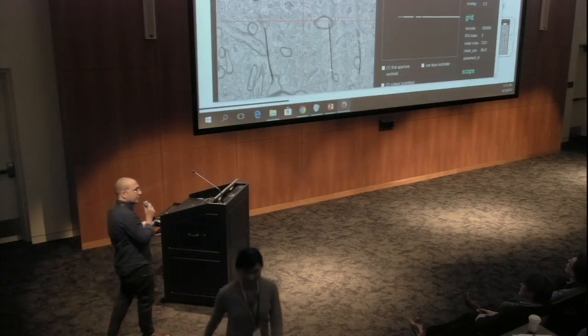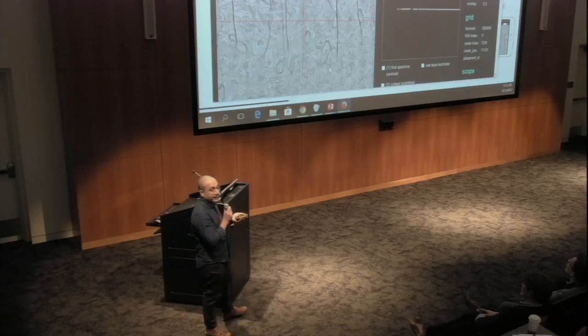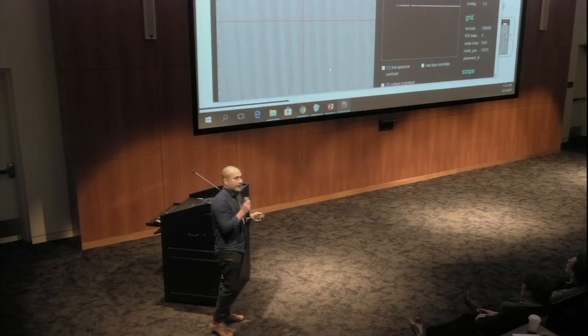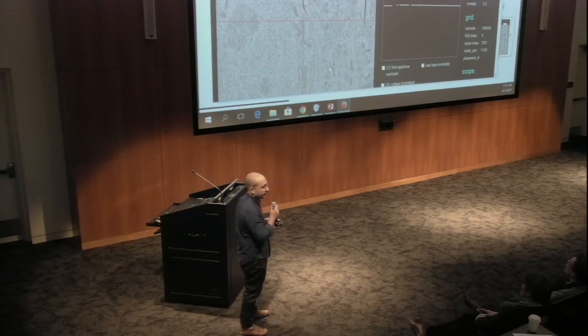So the next step, which we're not going to talk about, is to stitch and align all these sections into a coherent volume. And that's an effort that is being done not only by the Connectomics team, but in consultation with the array tomography team, the technology team, and our collaborators at Janelia Farm. What I'm going to talk mostly about is a data set that we collected last year that Derek already mentioned.